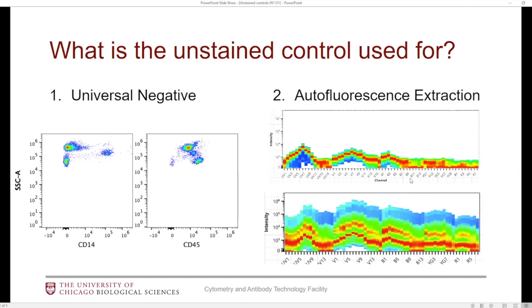There are two features in the SpectroFlow software. First is the universal negative, second is the autofluorescence extraction. These both come up while you are doing the unmixing wizard. The reason why you might want to utilize the universal negative is the negative gate that you are setting on your reference control is maybe not optimal for that control. So instead of using the data within that gate, which you can call an internal negative, we can instead direct the software to utilize an unstained tube that matches that control.